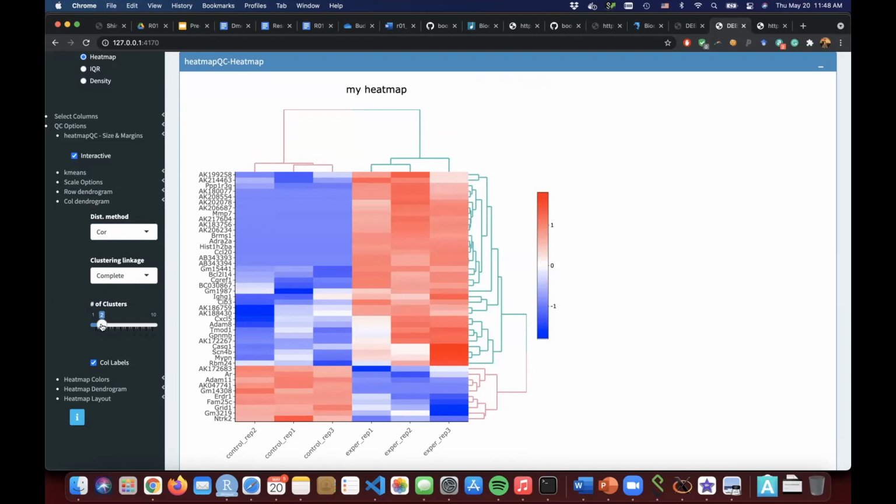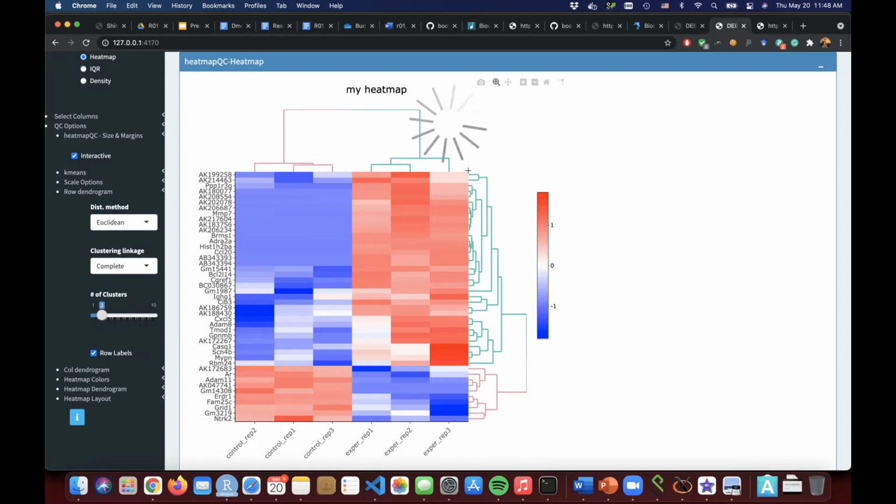And if you think here in the column, you have multiple clusters in your samples. In this case, there are 2, we know it, but you can change the number of clusters. It will change the colors in the dendrogram. But in the row, there can be like 1 cluster here. You see there's a separation, another one here, another one here, another one here.